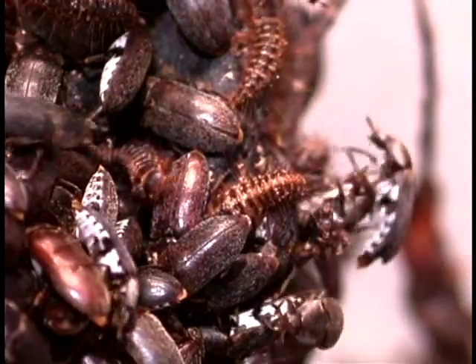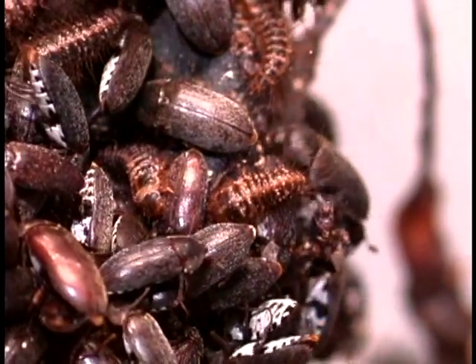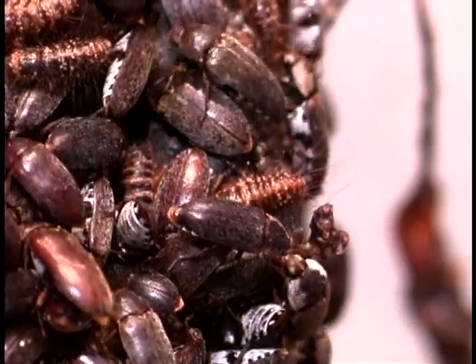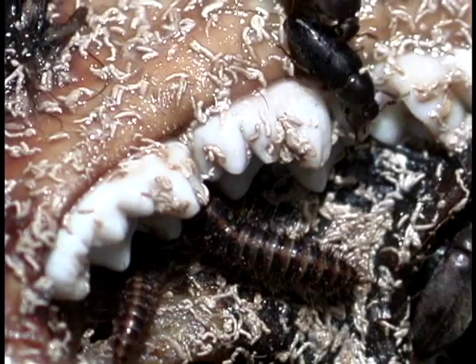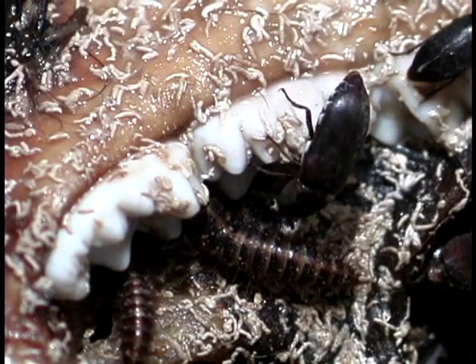Dermestids are voracious feeders and can clean the skeleton of a small mammal, like a field mouse, in a matter of hours. A large animal, such as an antelope, can take the dermestids between one and six months.